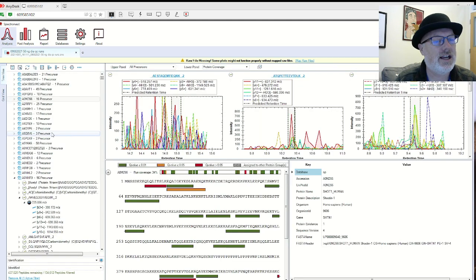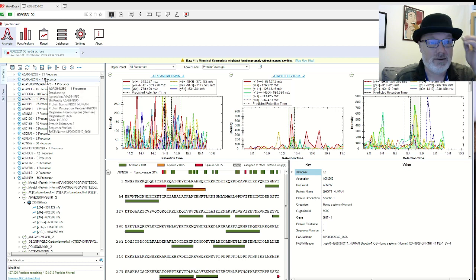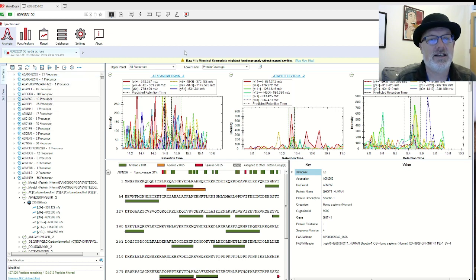Today we are going to go over how to change some of the fundamental settings in Spectronaut, like how to change from 1 peptide minimum to 2, maybe turn on and off imputation, some fundamental things you could change on your end. And then we'll go over the post-analysis view. I have about 40 minutes today, so we're going to have to stop at 40 minutes because we have our Proteomics Clubhouse at 11:30 and it's 10:40 on a Thursday.